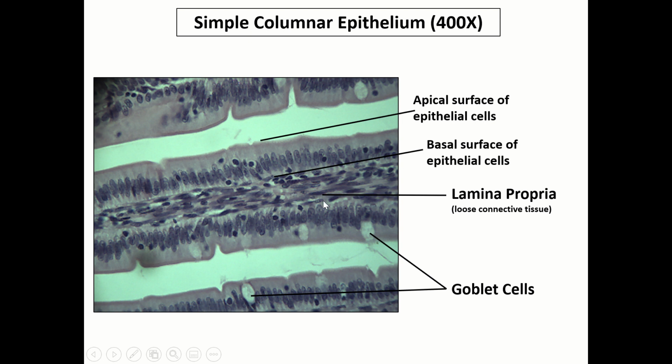As you look more closely here, you'll see that epithelial cells are not the only cells present. Periodically, you'll find goblet cells, and these are shaped like wine glasses or goblets, with what looks like the wide rim of the glass here, facing the more apical part of the cell. And the stem of the glass would reach down in this direction, a skinnier part of the cell, to anchor there at that basement membrane. Goblet cells are responsible for mucus production here within this tissue type, and they'll lay that mucus on the surface of these cells.